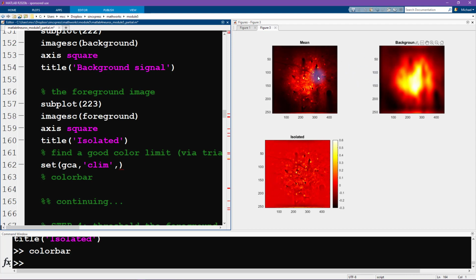And then we subtract these two, and that gives us the possibility for negative numbers. But negative numbers in this map here mean that the background signal was stronger than the average. So I'm going to start the color map at 0 to say that we don't really care about negative values in here. Negative values in this image basically just means that there was stronger blur.